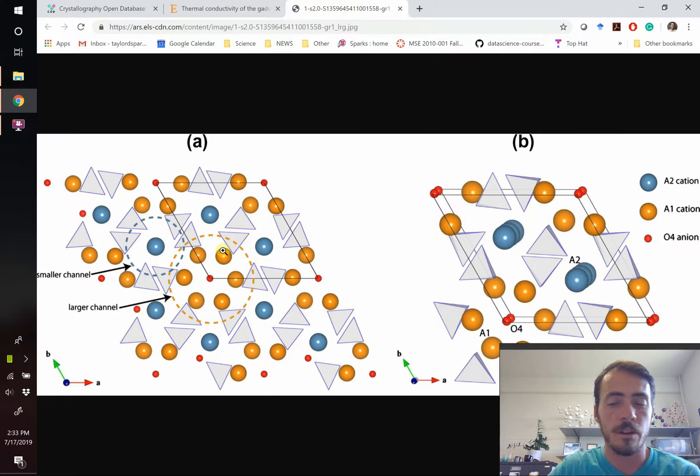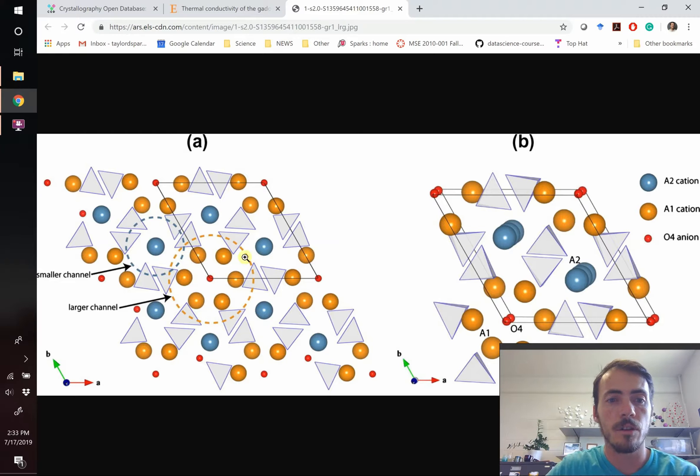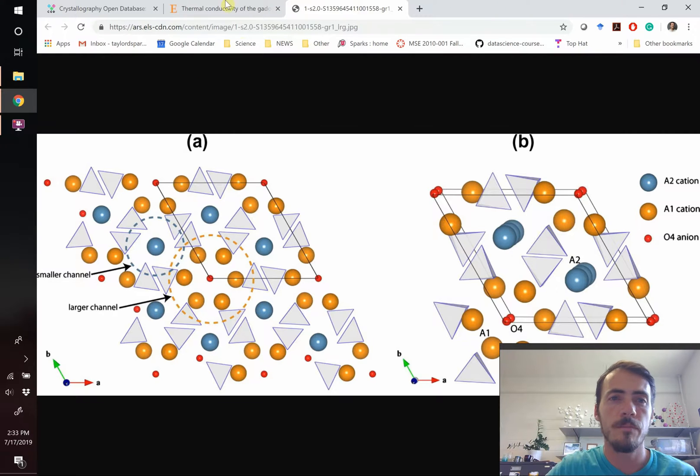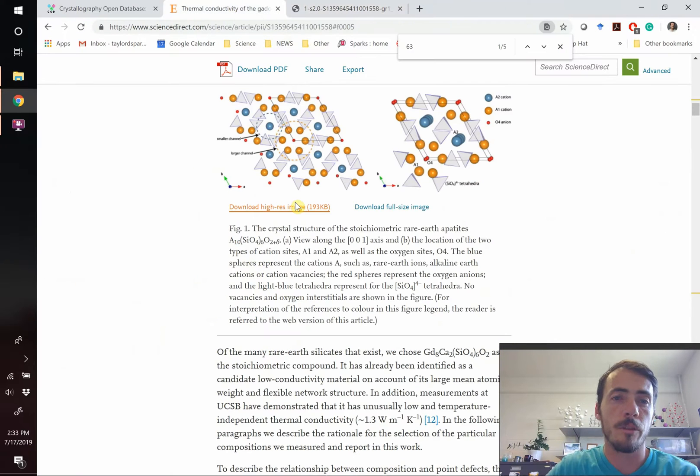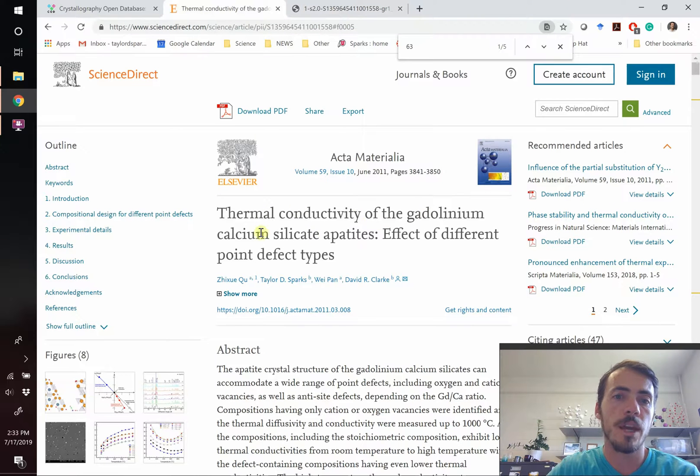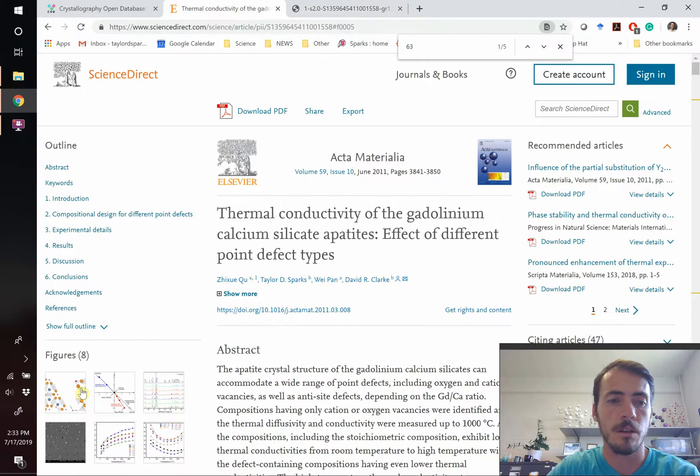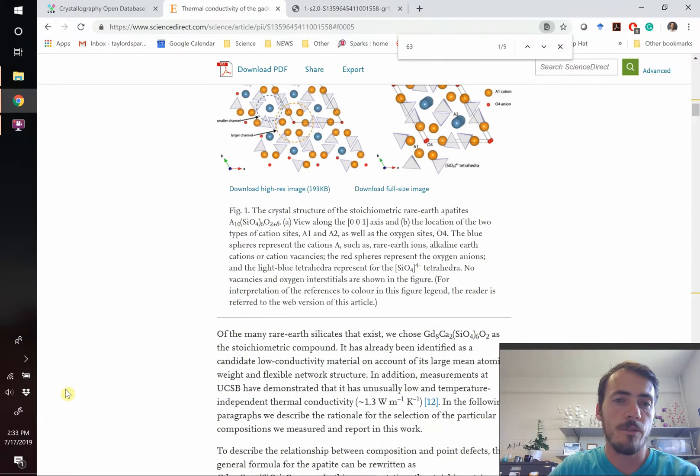This is an apatite crystal structure and you can see that they've gone to lengths to show that there's a large channel and a small channel. This comes from one of the papers that I wrote when I was a grad student entitled Thermal Conductivity of Gadolinium Calcium Silicate Apatites Effect of Different Point Defect Types.